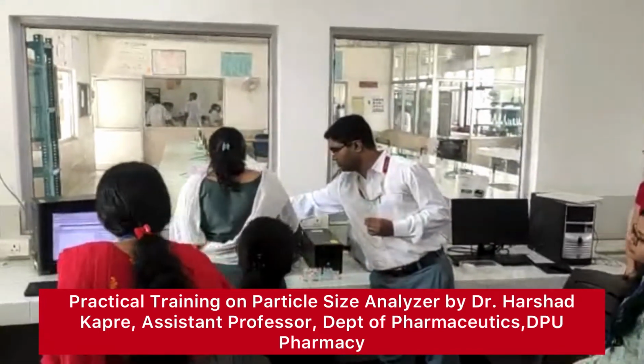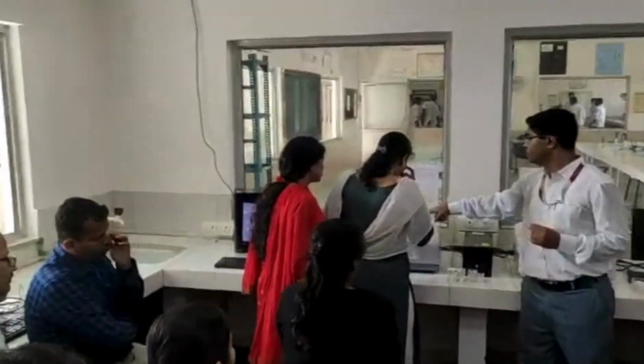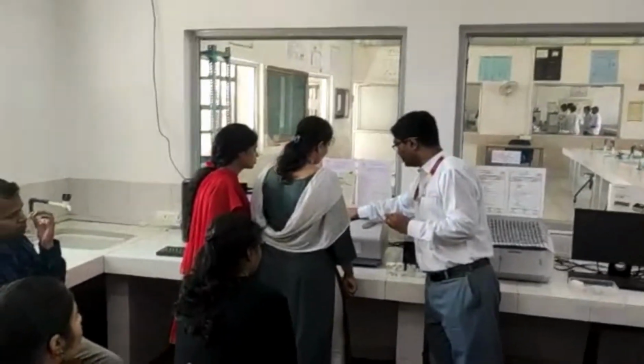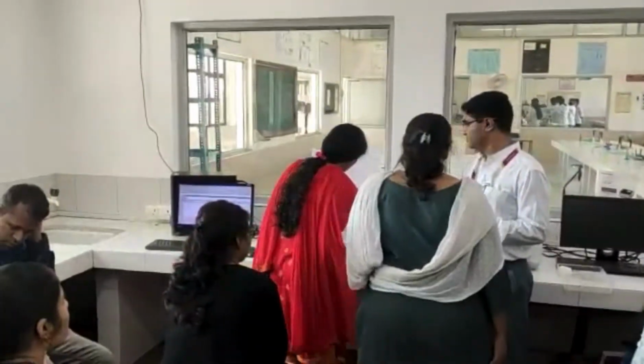So these are the electrodes. So like this you will pull that. This is for zeta potential. The same holder will be used, only there will not be any electrode attachment. Like this. Okay.